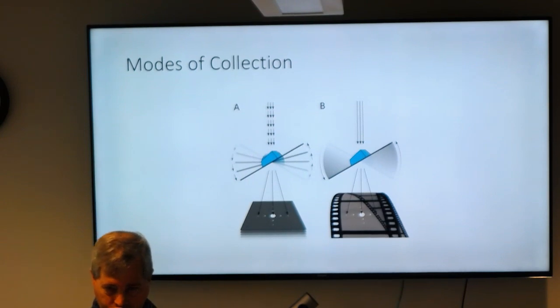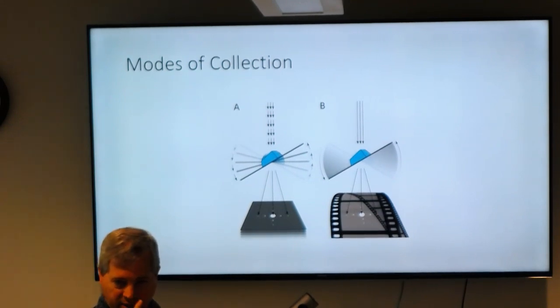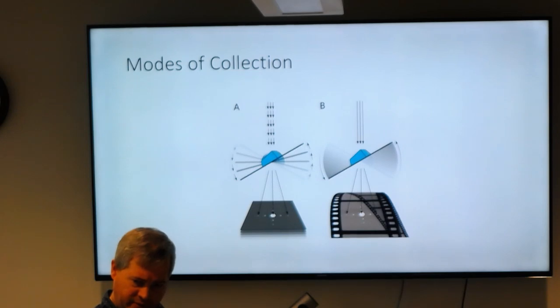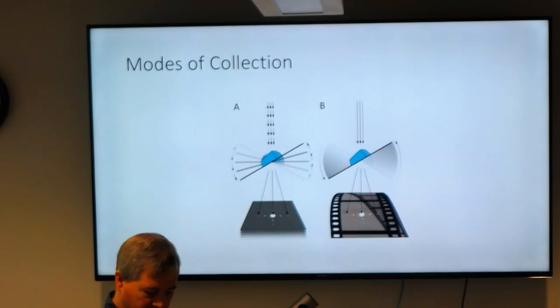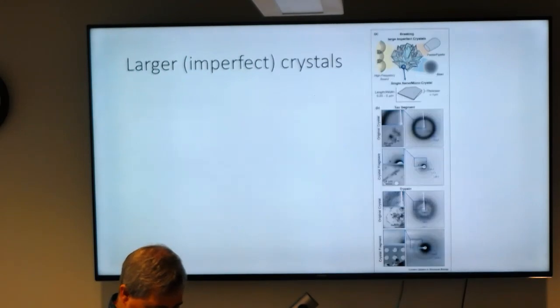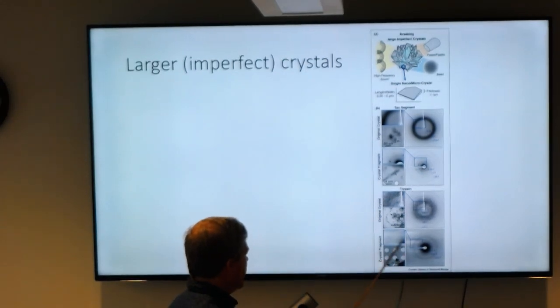And do all microscopes have a beam stop? They all have a beam stop. What you might want is a microscope that has a very small beam stop, so that you're not losing the lowest order diffraction spots. On our F20, it happens to have a beam stop which is quite small. Standard beam stops are a little bigger, so they'll block the lowest resolution rings. There'll be more stuff behind the beam stop, so you can imagine it might be a bit bigger than this.